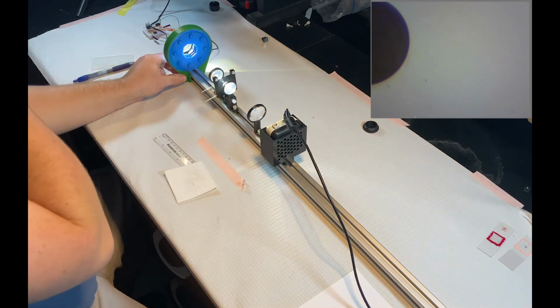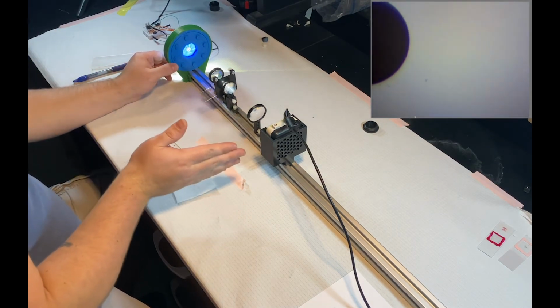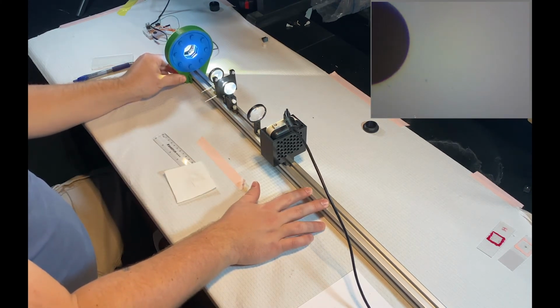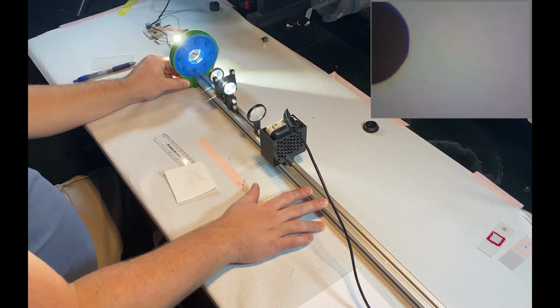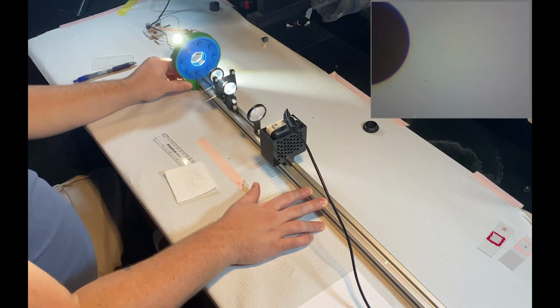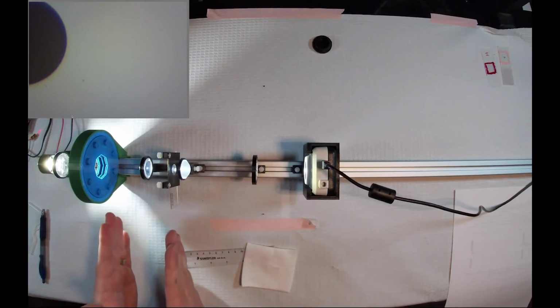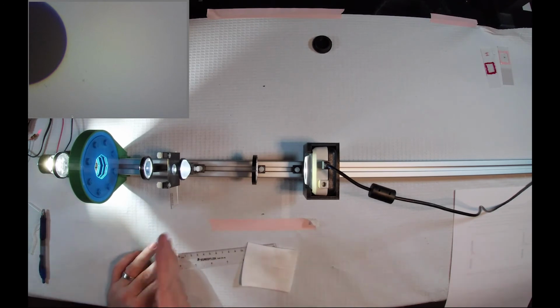So instead of being conjugate to our sample plane and our image plane, we're going to try to find a plane in here that is reciprocal to it. Now, from your readings and class, you should know that the focal planes of a lens are reciprocal to each other. The back focal plane is reciprocal to the front focal plane.